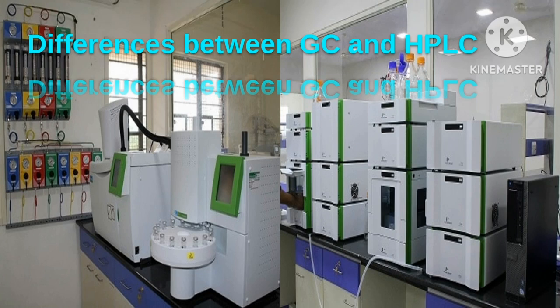This is Devi Sarojini. Now I am coming with another video about the differences between GC and HPLC. Both these techniques, GC and HPLC, play an important role in the pharmaceutical industry. So we must know the differences between them to analyze the samples with these operators.